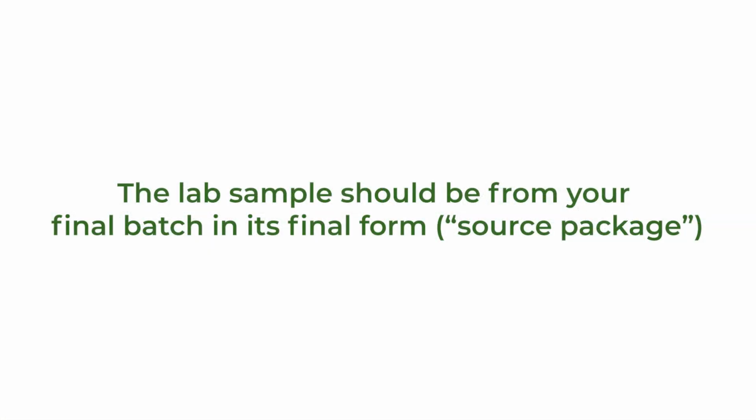When you've created your final batch in its final form, from that batch, you create a lab sample within the seed to sale system and designate that submit for testing. And then you send that to the laboratory of your choice. The laboratory performs those tests, uploads the result into the seed to sale system, and those test results are therefore associated with the source package that you created your lab sample from.